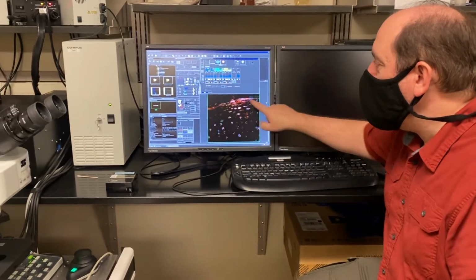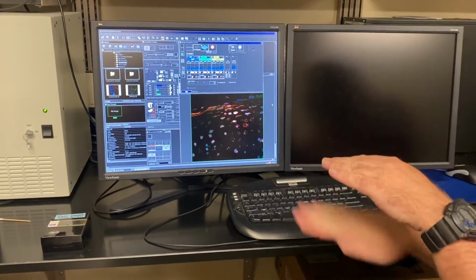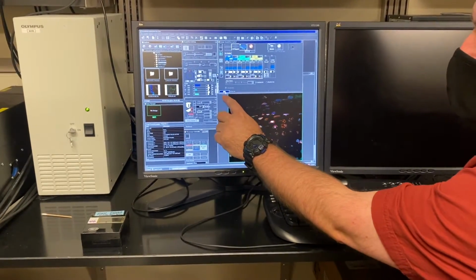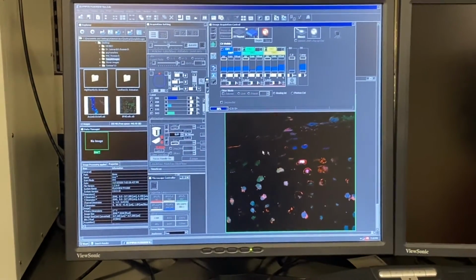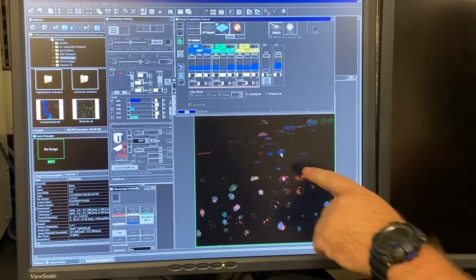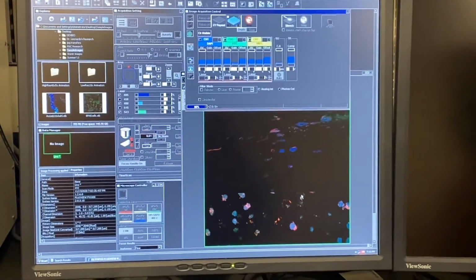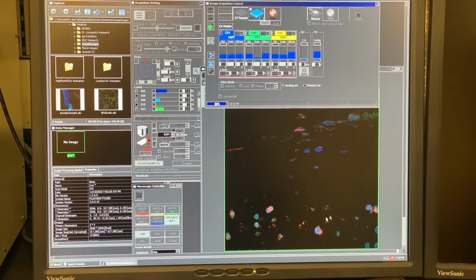It is now scanning our 9th tissue section. So it's going through all the way to the bottom layer. This indicates that it's still scanning. Here it says we are 88% done, right? We're scanning section 9 of 9. Notice that the DAPI penetrated pretty far down. We got a lot of blue and no green right there, whereas the green dye antibody did not penetrate as far as the DAPI did. And so here you can see the laser scanning across our last section.